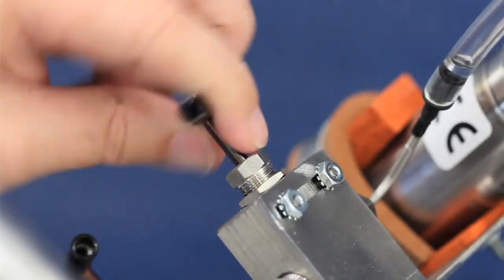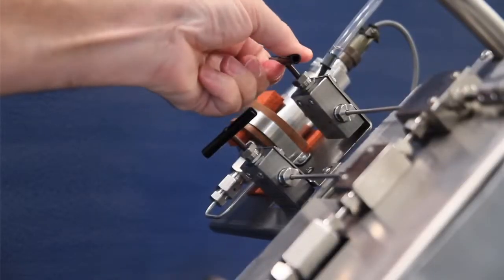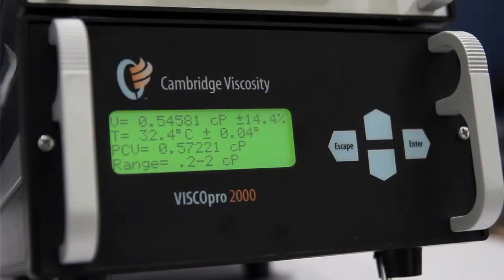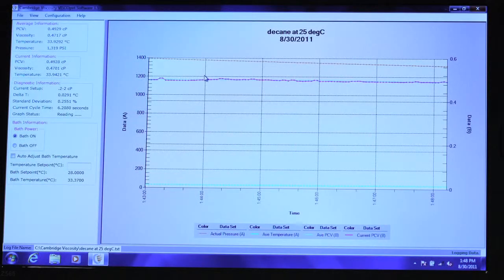Close the exhaust valve and continue pumping until the desired test pressure has been reached. Allow the system adequate time to stabilize to ensure the pressure is stable.